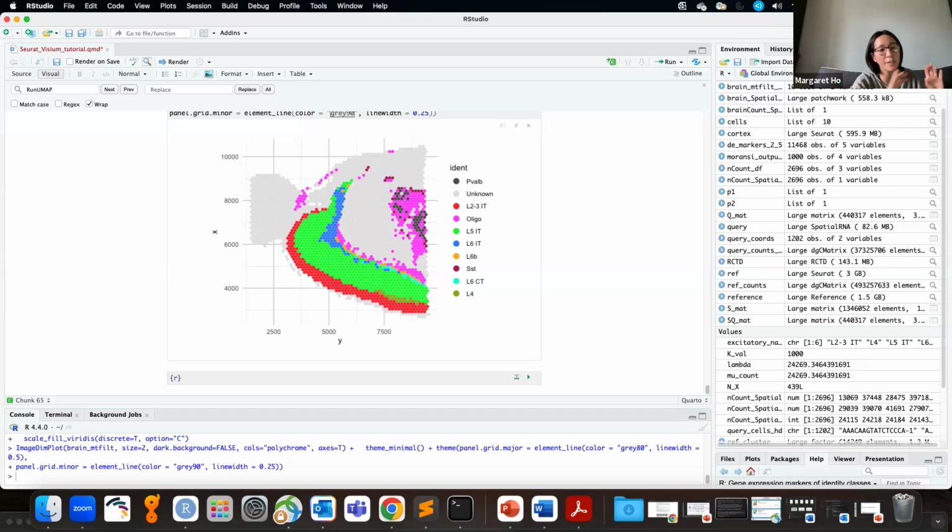I think I would just run it all on everything, and then if you wanted to do an analysis of that small section, then you would do the cropping towards the end. So the mito filter was done really, really early because I wanted to get rid of that across the entire data set.